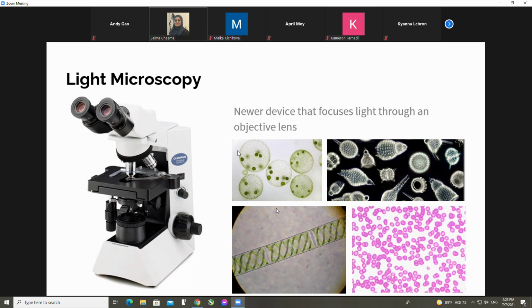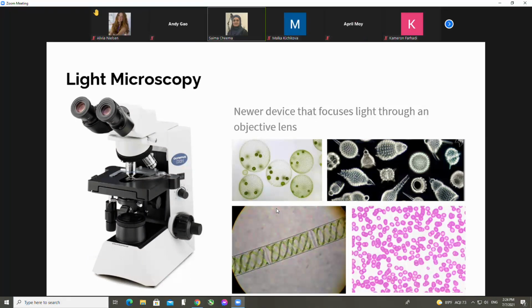Okay, you can see larger structures still with some fine detail. There are several smaller colonies that we can see within this larger colony, but we can't see the finest detail, because that's beyond what this microscope could have resolved. So power of resolution is just how clearly you can see detail.